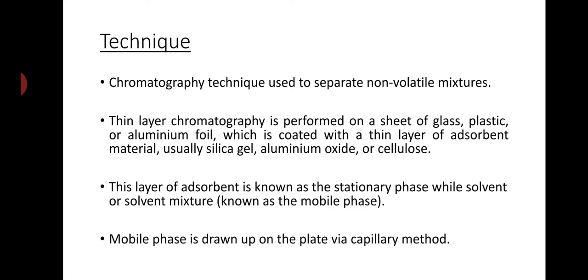This layer, when you make it, becomes an adsorbent, and it acts as the stationary phase. So there are two terms in this TLC: one is the stationary phase and one is the mobile phase. Don't ever forget them. There are two such components you should always remember: stationary phase SP and mobile phase MP. The stationary phase that you have prepared is the silica gel plate, and the mobile phase is the solvent that you have prepared, which actually runs in the system.